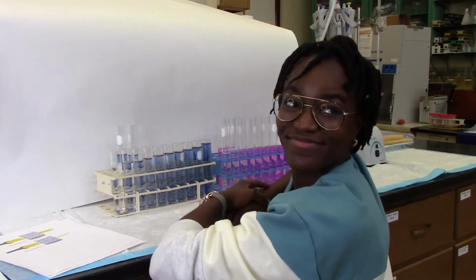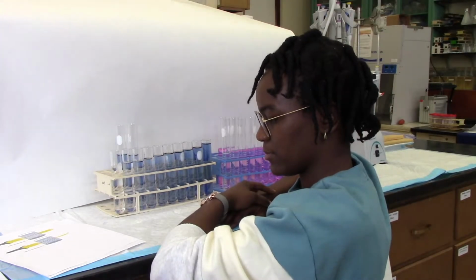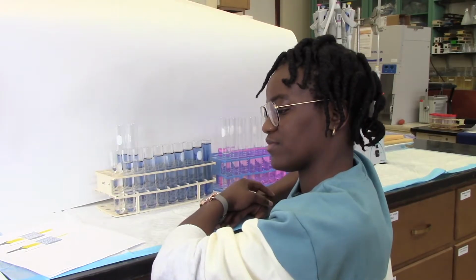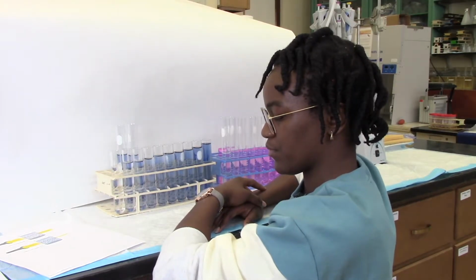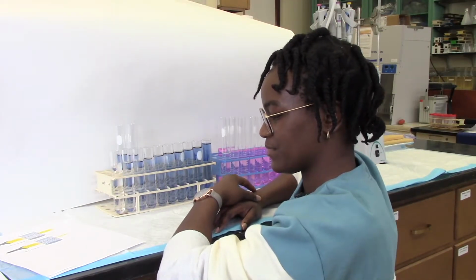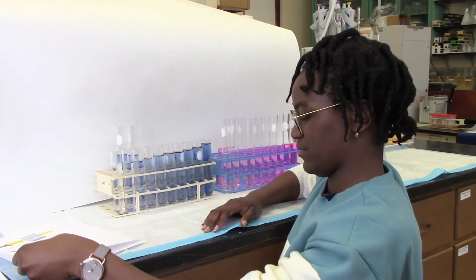There's lots of different ways to look at the chemistry of water, plants, animals, and sediment. One of the most common methods we use is called spectrophotometry. That's the addition of chemicals or mixtures of chemicals called reagents to produce a color with the intensity proportional to the concentration of the element or chemical being analyzed for.